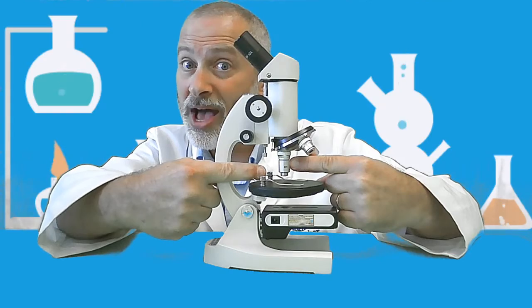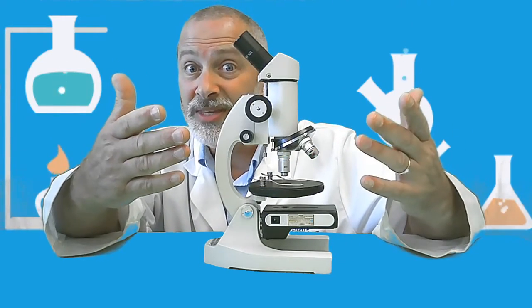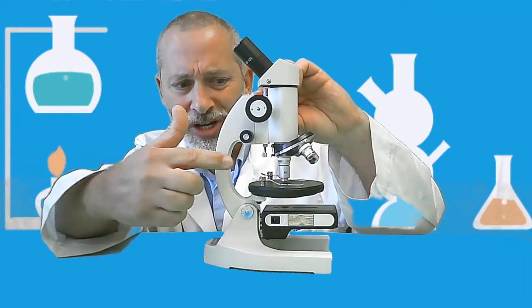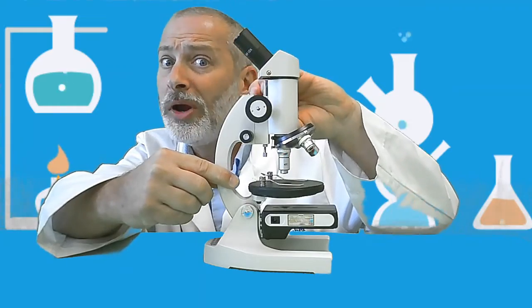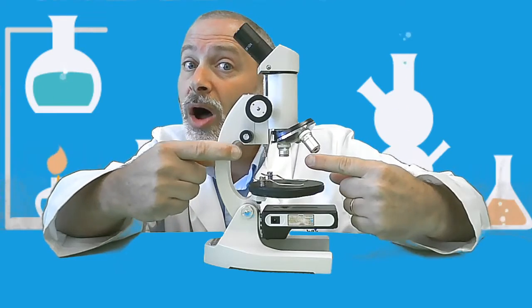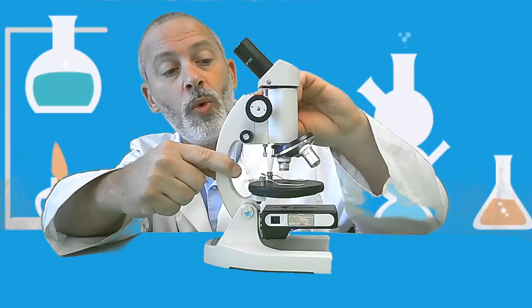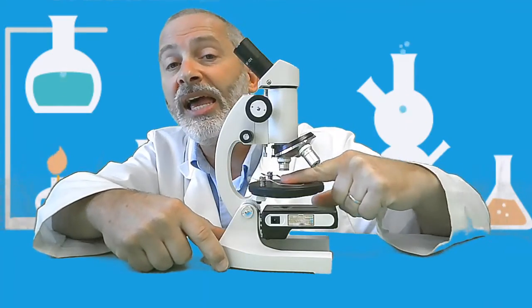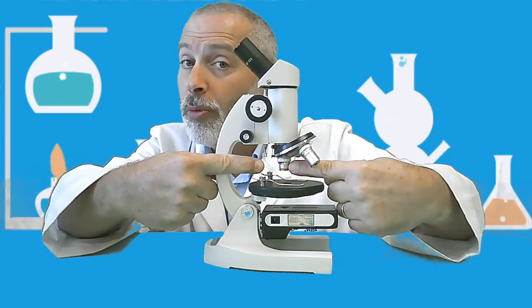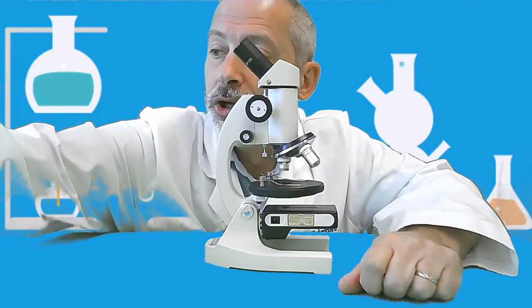Is this the low power objective lens? Which means if somebody bumps into this, or gravity pulls the body tube down while in storage, damage could occur. We don't want damage to occur. So always put it back to the low objective lens and lower the body tube all the way. And notice there's plenty of room between the low power objective lens and the stage, so no damage will occur.